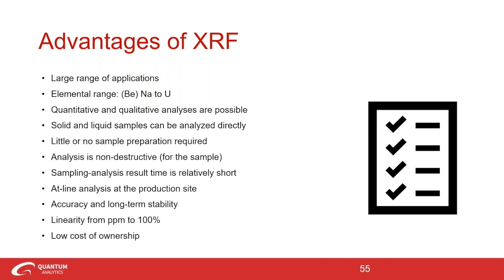Also, XRF can eliminate errors that are due to sample inhomogeneity and are easily minimized by using larger sample volumes. XRF can measure gram quantities without any risk of cross-contamination, and therefore there's less error in these types of results.